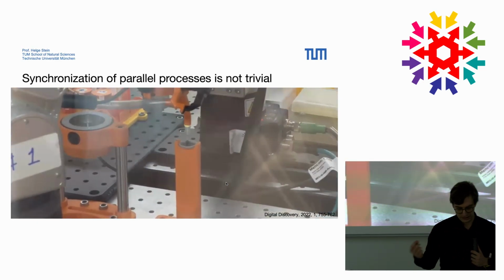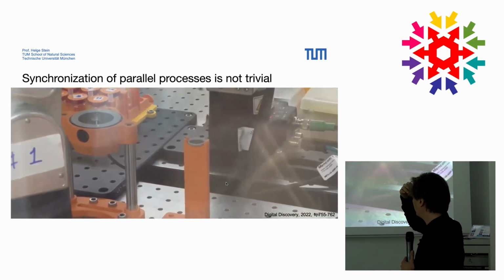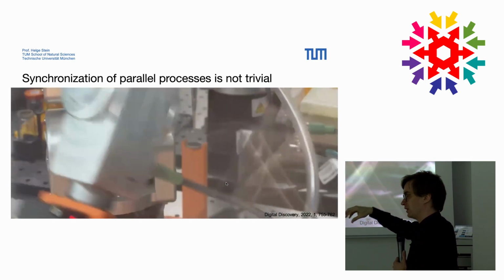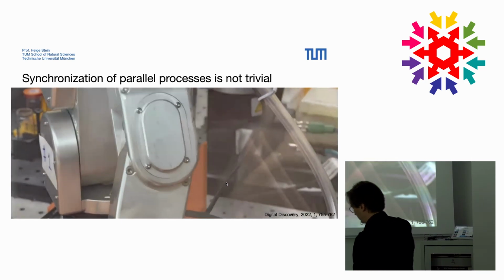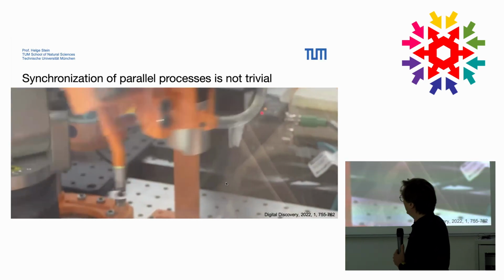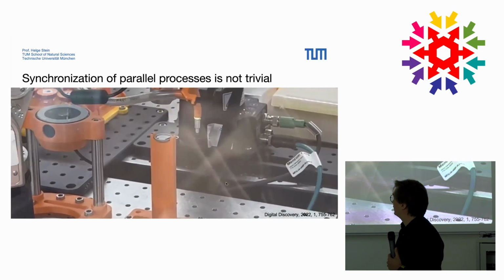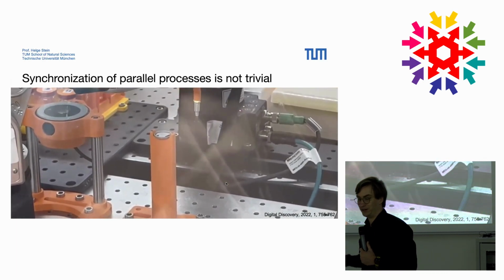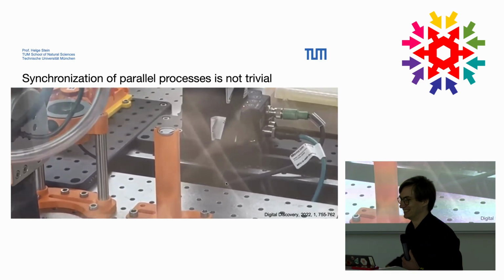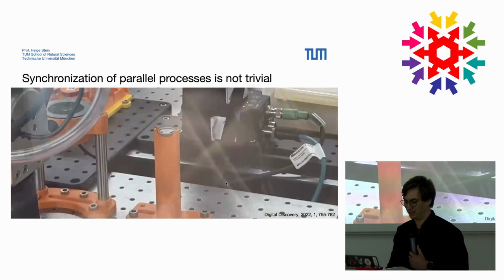So for instance, what it did here is when we picked up that piece of an anode, in this case, we always pick it up slightly off center. And then when we take a picture, we do an automatic edge detection, and then we can place it perfectly in the center. So we are actually really well reproducible in terms of how we place the different parts of a cell. We always take pictures before and after, because very often when you think you placed it correct, you actually don't. We don't care about the placement of the separator because that's anyway not reproducible.